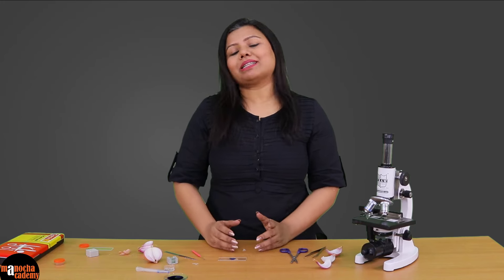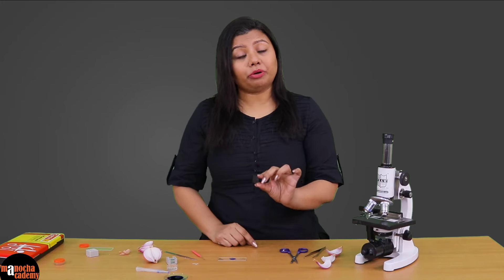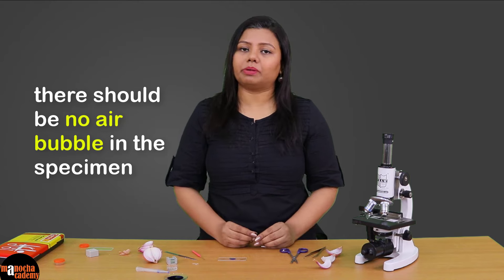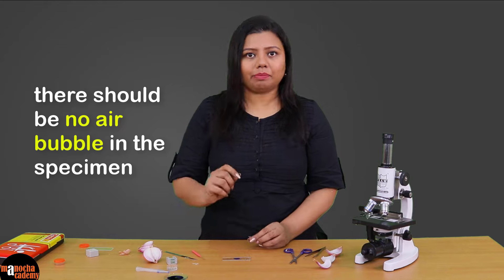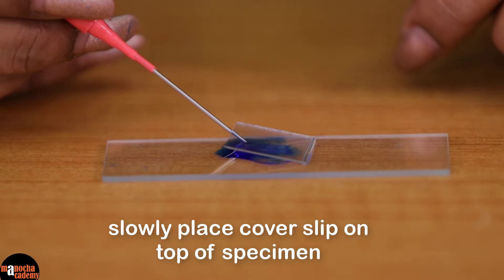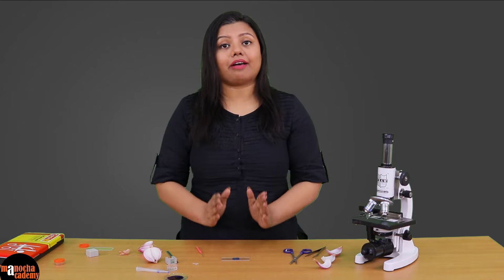To make sure that the specimen does not dry out, we will cover it with a cover slip. I am using a square cover slip; you can use a round cover slip if you have one. While we put down the cover slip we have to be very sure that there is no air bubble trapped inside, because if there is an air bubble the specimen will not be clearly visible under the microscope. The technique is to touch the cover slip onto the slide, balance and support it with the needle, and slowly take the needle out — and you will see that there is no air bubble left. The specimen is now ready.